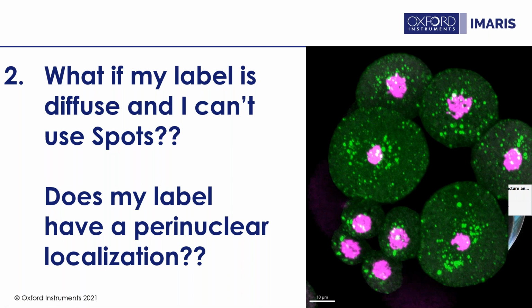Is it found closer to the nuclei, or is it evenly distributed throughout the cell? This often comes up, and that's why I use this example with nuclei, because people want to look at whether a protein has a perinuclear localization, or if disruption of the nuclear import is causing a pileup right around the nucleus and that sort of thing. So there are nice experiments where this can help you as well.